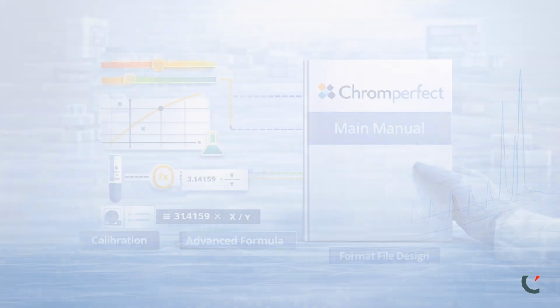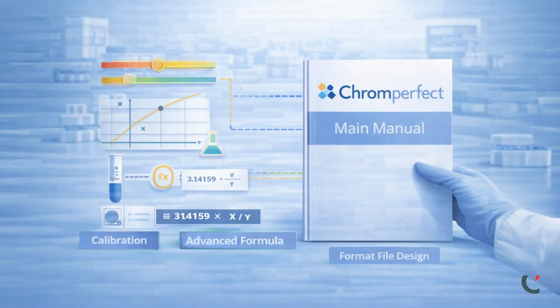At this stage, it is important to recognize that many of these advanced reporting features can become quite complex and often rely on configuration across multiple areas of the Chromperfect system. This may include the use of upper and lower limits within calibration, advanced formula definitions, and detailed format file design. The purpose of this training series is not to explore every advanced configuration in depth, but rather to provide a clear overview of the capabilities within each module. If your application requires more advanced reporting or custom configuration, we recommend referring to the Chromperfect main manual, where these topics are covered in detail.